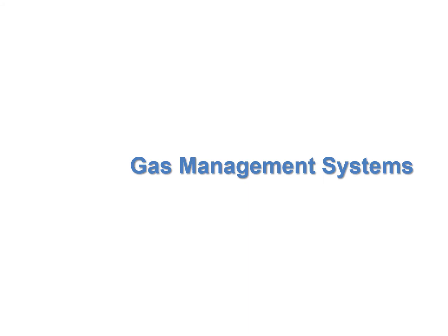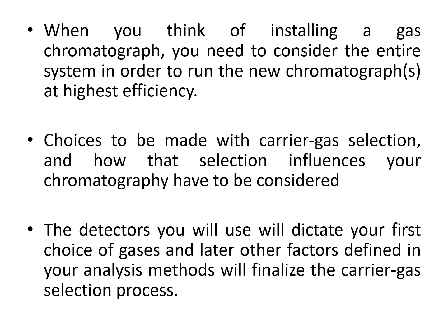Good day to everyone. So class, today I will start our lecture with gas management system in gas chromatography. When you are thinking of installing a gas chromatograph, you need to consider the entire system in order to run the new chromatograph at highest efficiency.